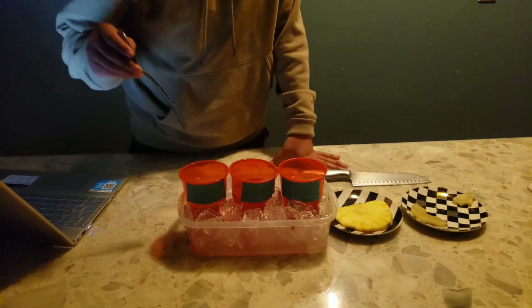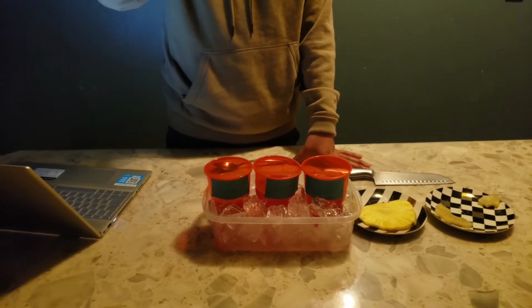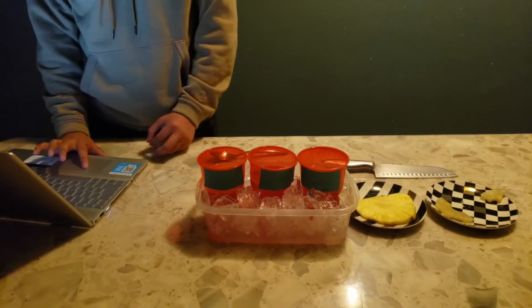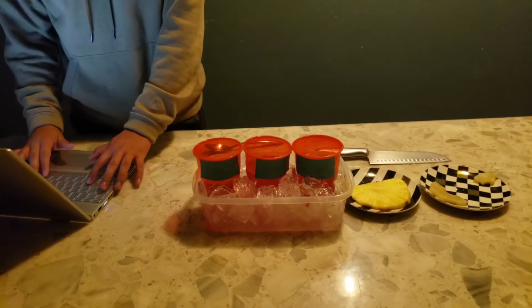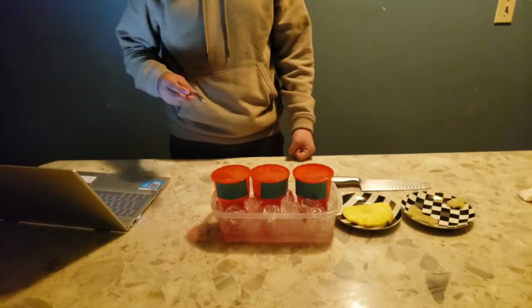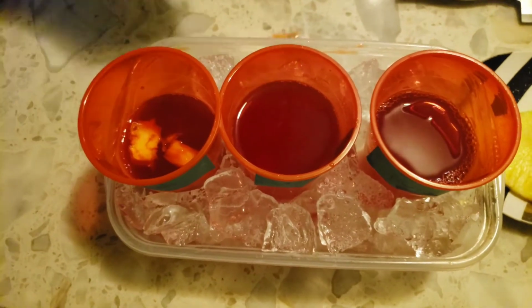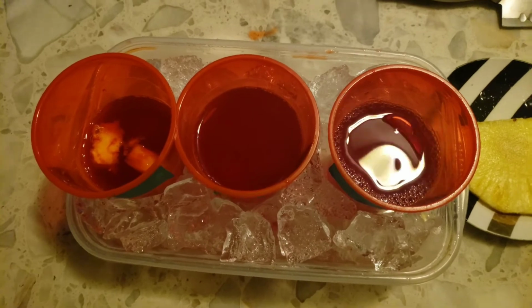It has been 4 minutes, and the solutions remain the same, as the fresh pineapple still floats, and the canned pineapple is sunken. Okay, it has been 6 minutes, and the solution remains the same, as the fresh pineapple still floats, and canned is sunken, while the no pineapple has no reaction since there's no enzyme.